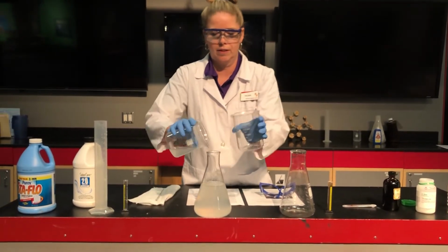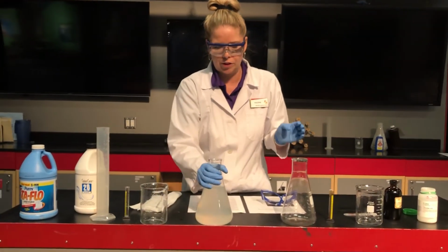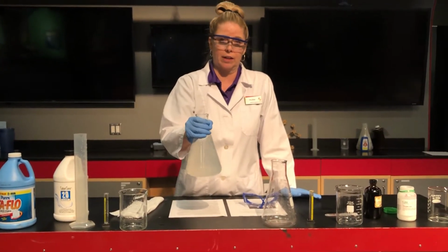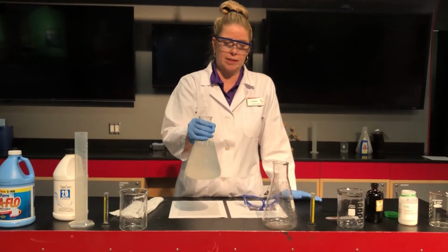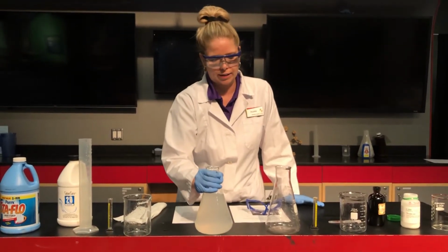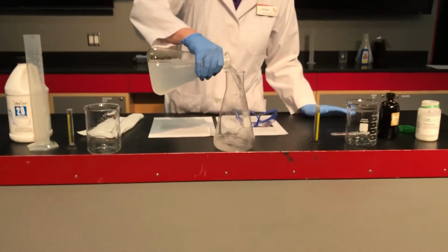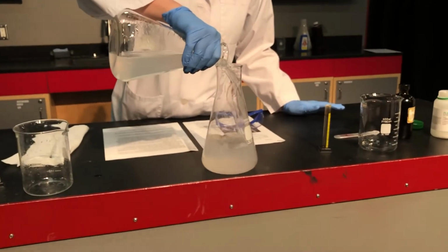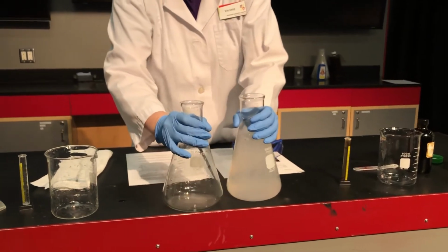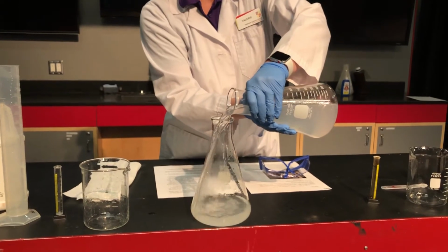I'm gonna get the last of this out. And then we do have to wait a little bit. So this reaction is called iodine clock reaction because some time has to actually go by. It's a bit of a time release reaction. And something that you can do to kind of speed it up is swoosh it back and forth between two beakers. So we'll see if this speeds it up at all. And now all we're doing is kind of mixing it up by pouring it back and forth between these two beakers, or flasks really.